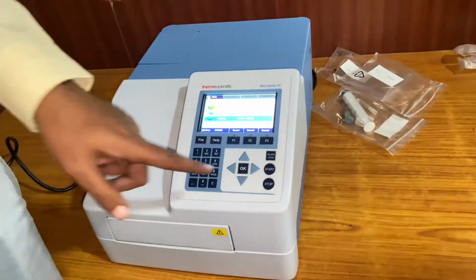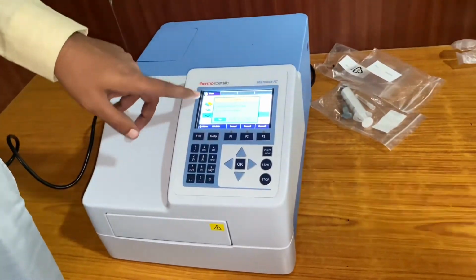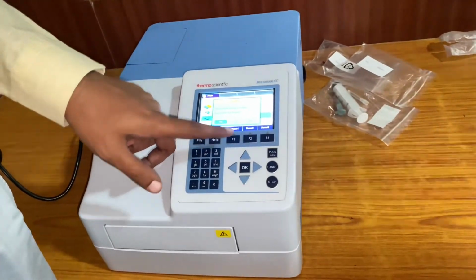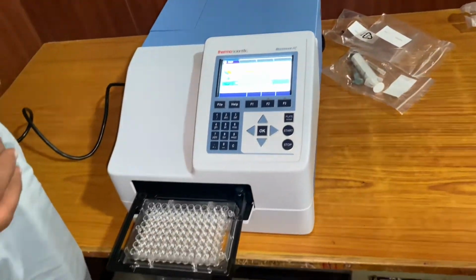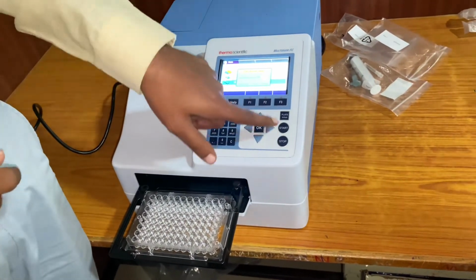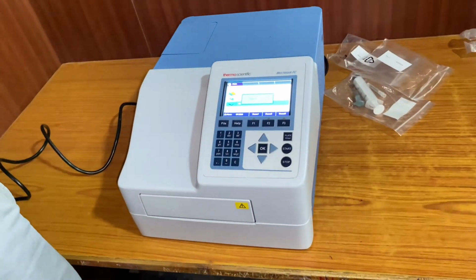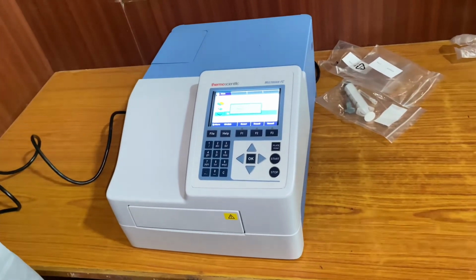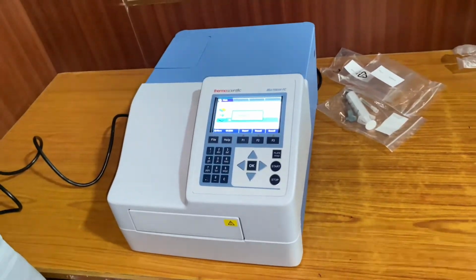Plate in, and then it will ask, I made some changes from 405 to 450, do you want to save those changes or not? You can just say I don't want to save. Okay, 1 to 96, directly it will give 1 to 96. Just press start. I have given shaking for 5 seconds before reading. So it has done shaking, then it is taking the reading.